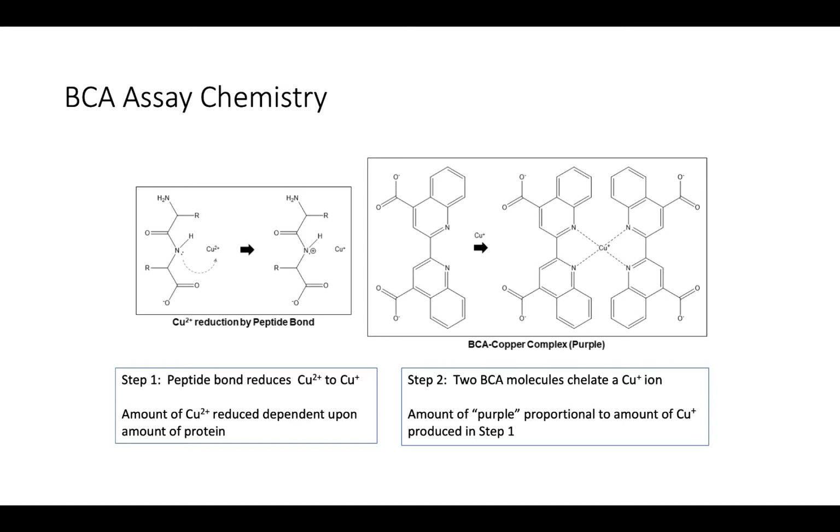And as you produce the samples that you'll need for your standard curve, what you will visually see is a gradient of purple. You'll go from light purple to dark purple because your concentration of protein to create that curve is increasing. Beautiful assay from that standpoint.